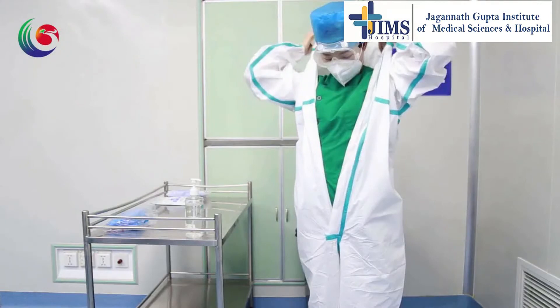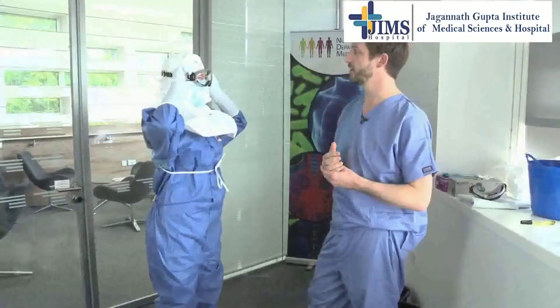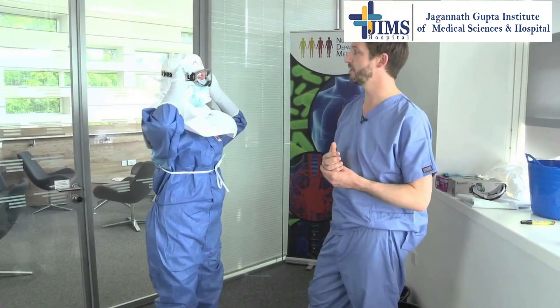Doffing is the process of taking off all personal protective equipments. Always remove personal protective equipments under the guidance and supervision of a trained observer.